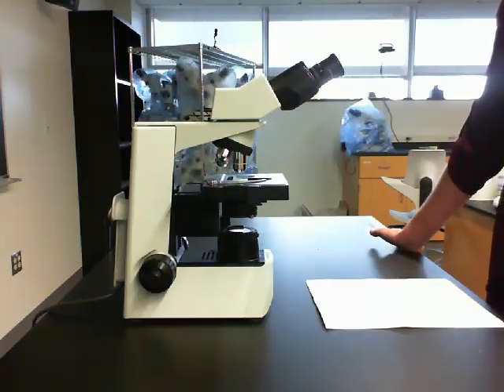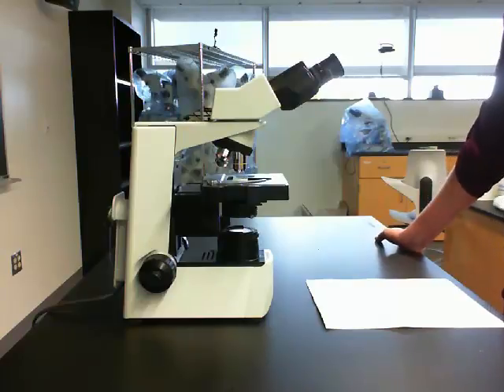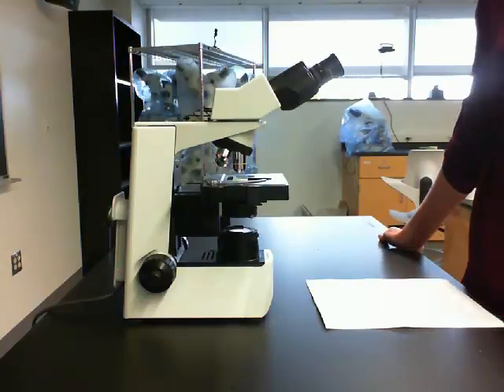Compound microscopes are an invaluable tool for making observations of specimens. However, like all tools, they depend upon the skill of the person using it. Be sure to practice making these adjustments so that you become an expert with the microscope.